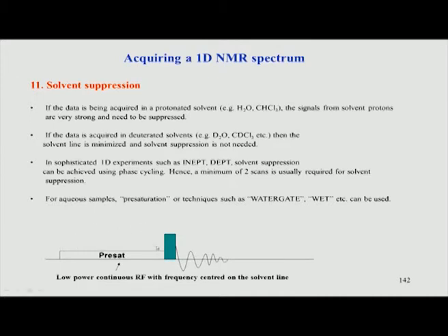We will not be able to go into details of how that saturation happens, but the idea is very simple: you take the chemical shift value of the water protons, and you apply at that frequency a weak continuous RF. Weak means a really weak signal. The strength of this signal is typically about 50 to 100 hertz.